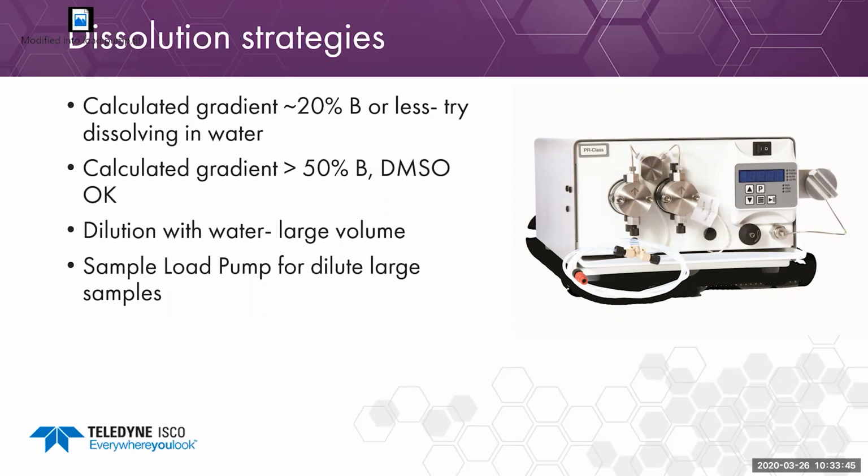As long as it's in solution and is in a weak solvent, generally the sample gets concentrated in a nice band at the head of the column. And this sample load pump is also pretty good for diluting, for desalting samples as well.